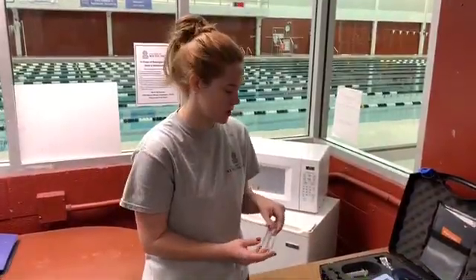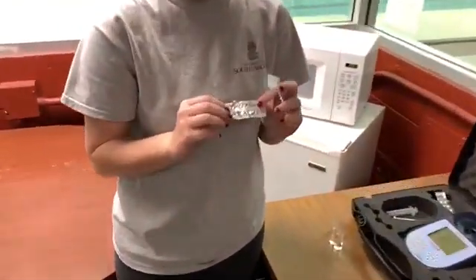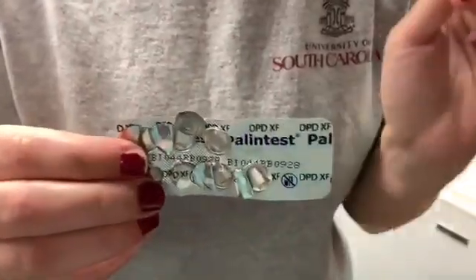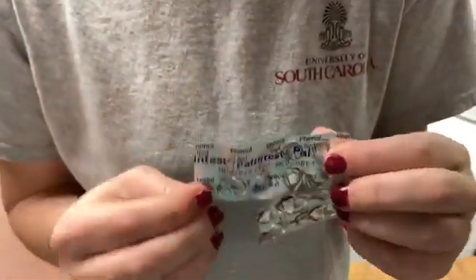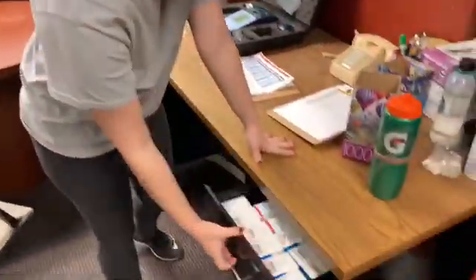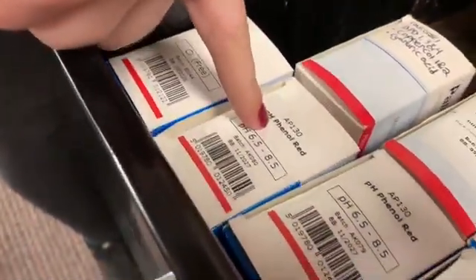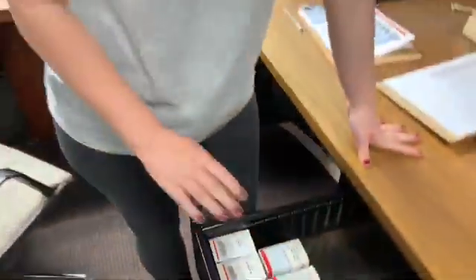After you've gathered your two tubes of water, you will then use these tablets. The first one is going to be DPDXF. The second will be Phenol Red. If we ever run out of these tablets, you will find some more in this drawer right here — DPDXF and pH Phenol Red. If we ever run out of these boxes, you will contact Mike or Ashley.